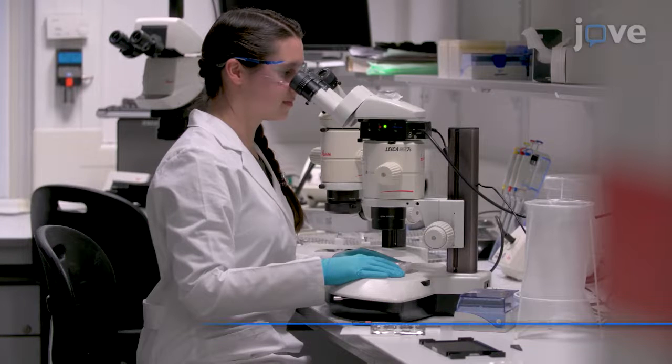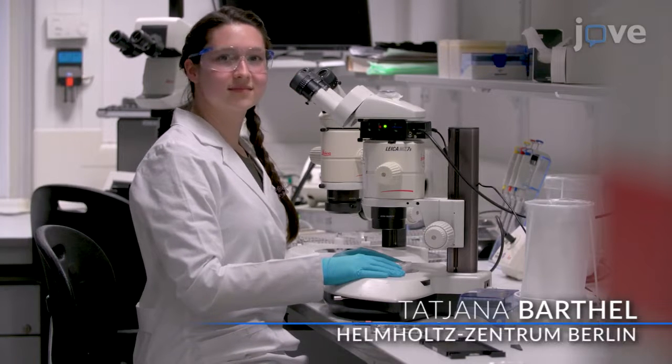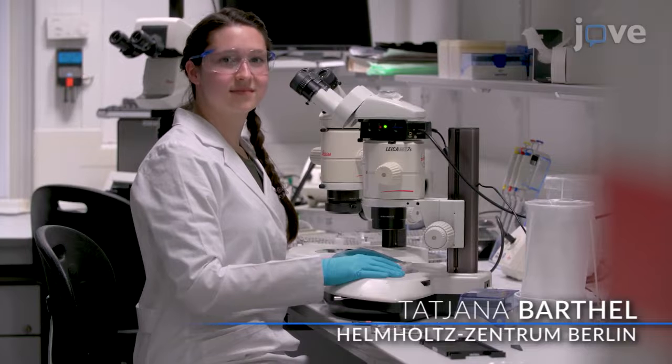The quality of the results is intimately connected to the quality of the sample handling. We believe that the following visual demonstration will help researchers to carry out high-quality experiments. Demonstrating the procedure will be Tatjana Bartl, a doctoral researcher and PhD student in my laboratory.